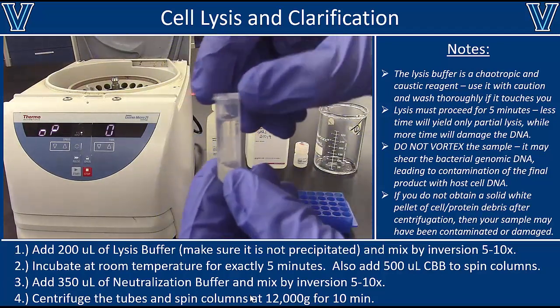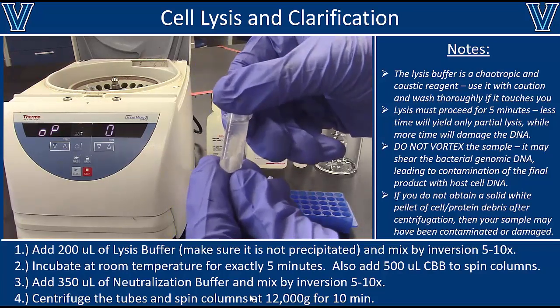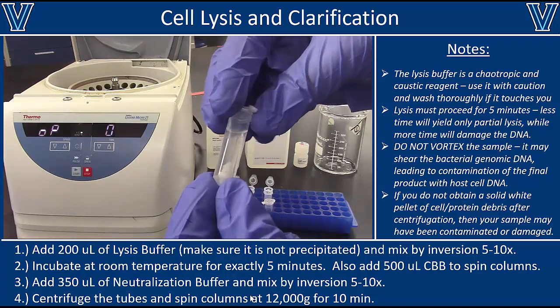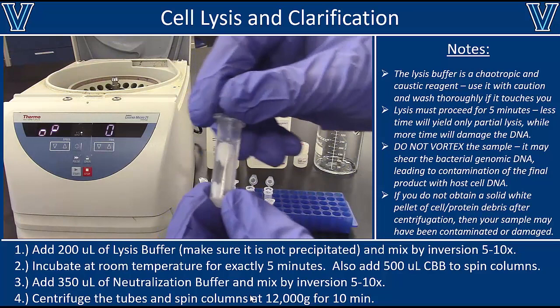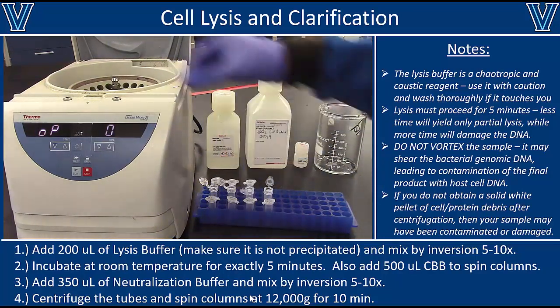All right, so after that 10-minute spin, your tube should look something like this. You should have a tight white pellet near the bottom of the tube with a nice clear supernatant on top of that. So you should absolutely have something that looks like this. If it's more diffuse, that's a sign that it might be contaminated. Your culture might have been contaminated by something like a fungus.